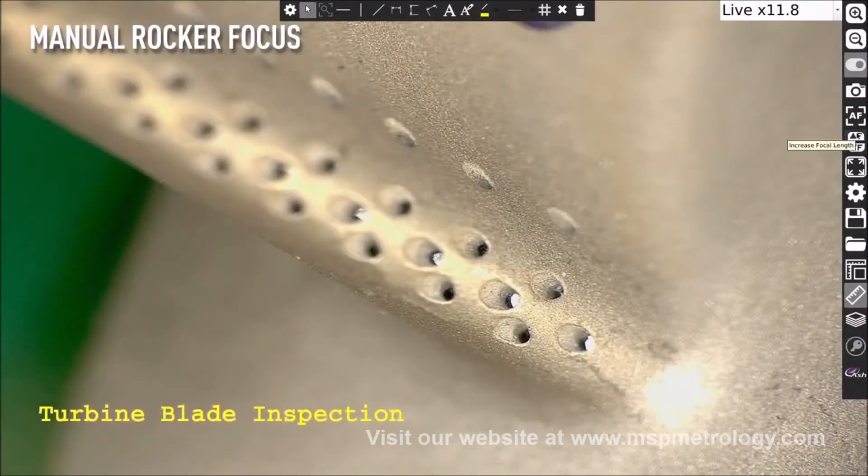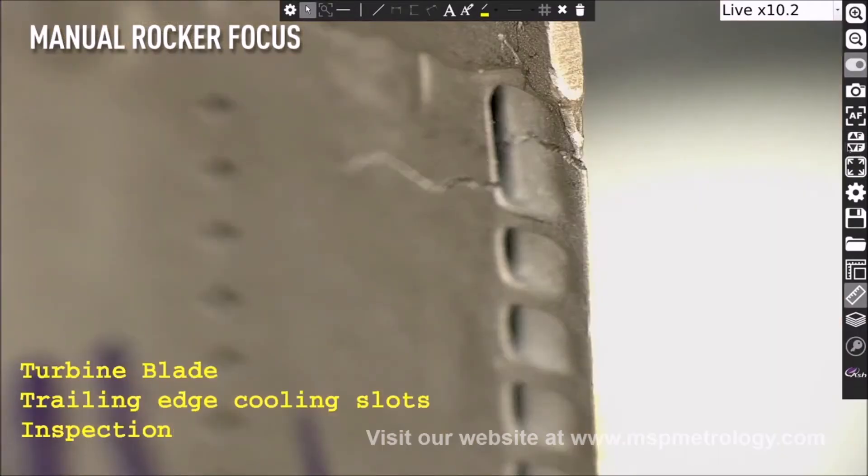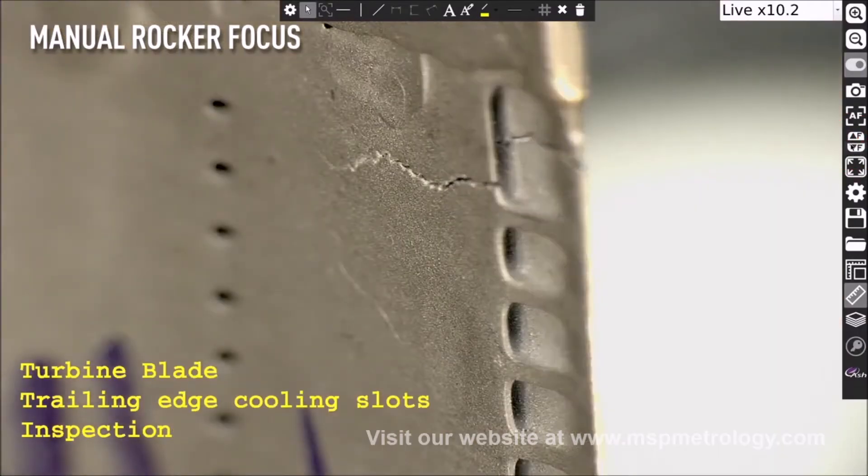Using the new Manual Rocker Focus feature, quickly adjust the focus of the camera on your part by selecting the near and far focus, utilizing the rocker icon.